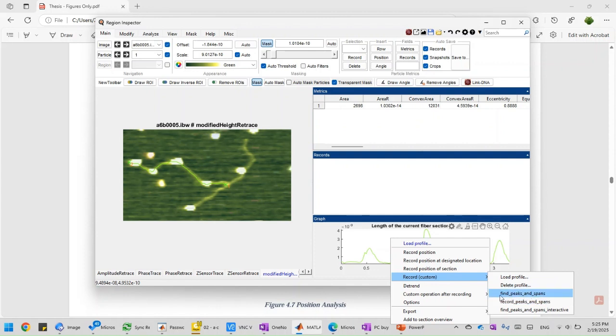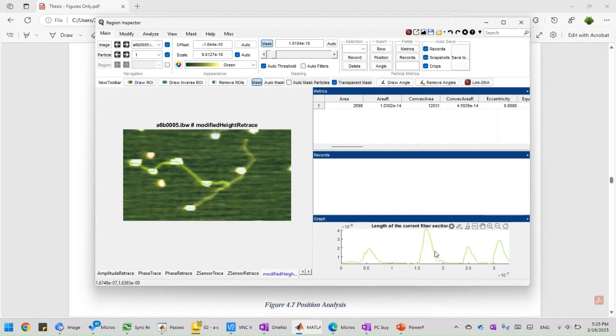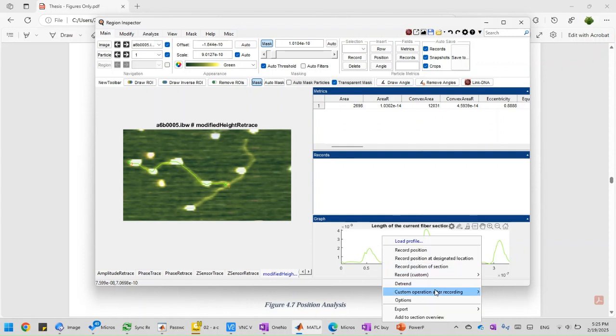The other thing I would like to do is determine whether my complex is a specific complex or not. As I just mentioned, if there is a crossover between the protein peaks' span and the DNA specific region, then we say it's a specific complex. Otherwise, it's a non-specific complex. Now the program can also do that automatically for you. I wrote a script especially for that purpose.